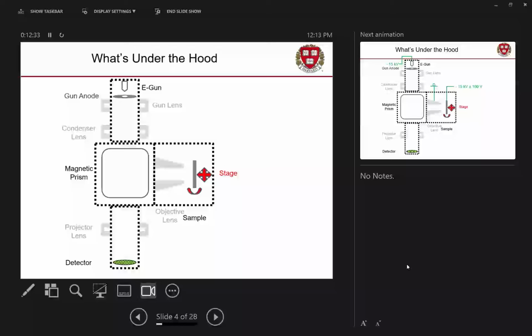So to make an electron microscope, you need, broadly speaking, three things. You need something that spits out electrons to make the electron beam. You need lenses, like any microscope, to focus the beam and magnify up the image. And you need some way of getting an image into the beam, meaning some way to interact with the sample. These gray U-shaped objects I have labeled as lenses. These are magnets. Glass lenses do not work on electrons. The electrons bonk into the glass and stop.